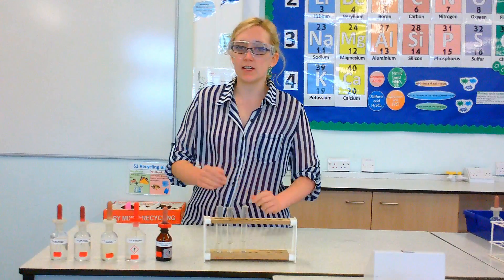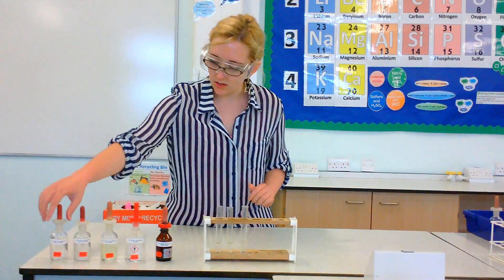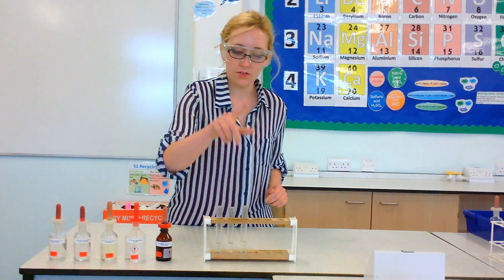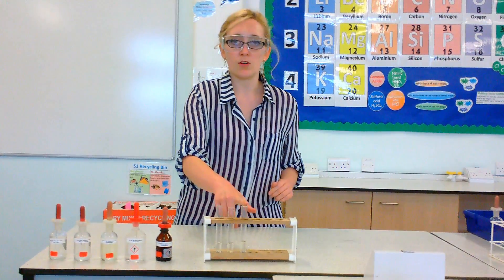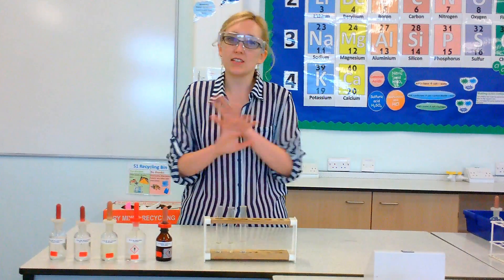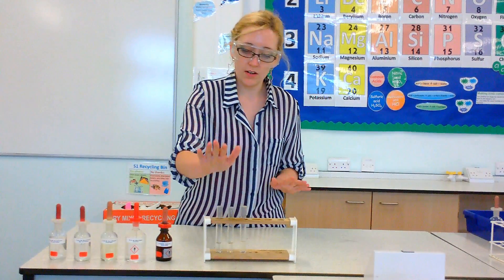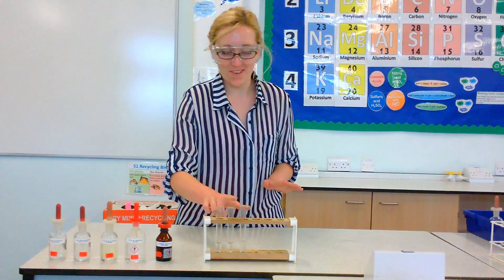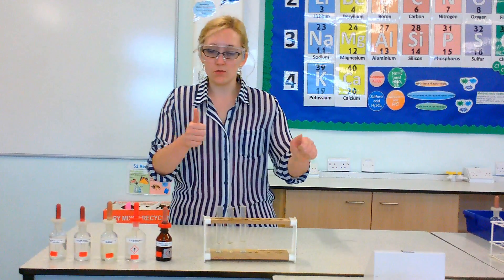Now what I've already got in these test tubes in front of me: I have some sodium chloride in that one, sodium bromide in that one, and sodium iodide in that one. It doesn't matter if you've got sodium bromide or magnesium bromide — it doesn't make any difference. As long as you've got a chloride, bromide, and iodide, you're all good.